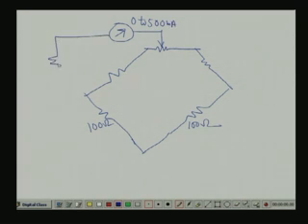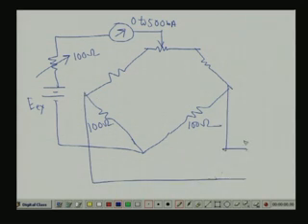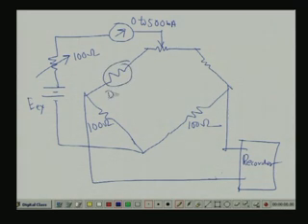This is coming through a resistance of 100 ohm. It is coming here. So, this is the excitation voltage, bridge excitation. So, this is coming to the recorder, because this is the unbalanced voltage. Okay. So, this is detector 1, and this is detector 2.